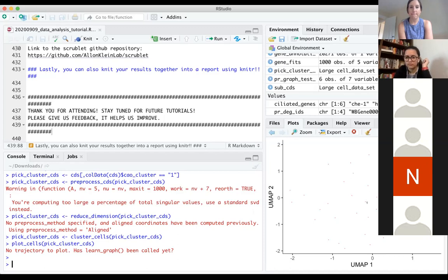Hey, Caitlin, I had a question from earlier on about what if we don't like how our cluster looks and how we can approach redoing that. We did ours on, I believe, a population of cells that might not have the highest hierarchy, so the hierarchy might be quite shallow. When I played around with our first run with our data and went to cluster, it just made one cluster with all of our data because I think it's not very deep.